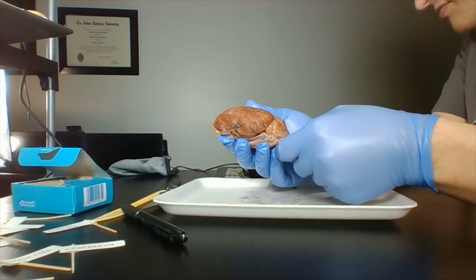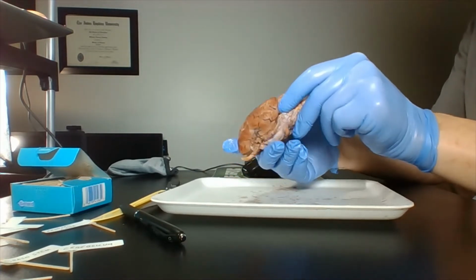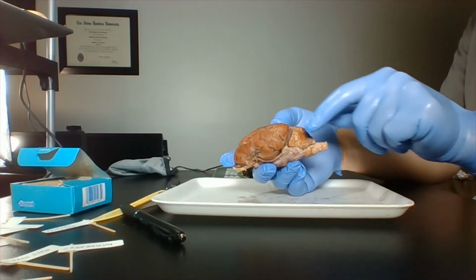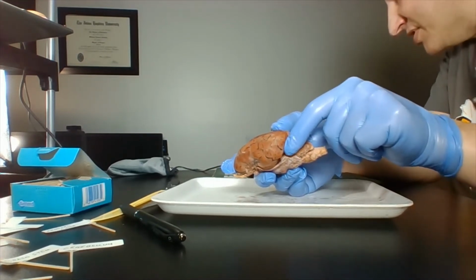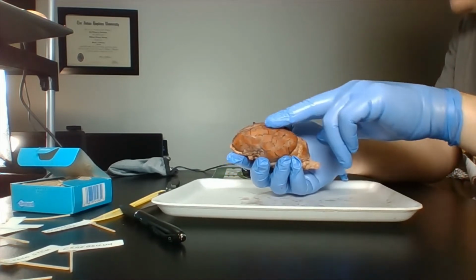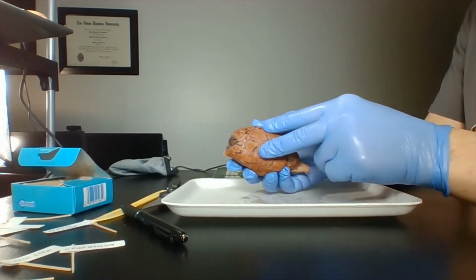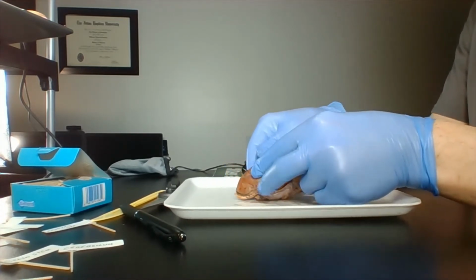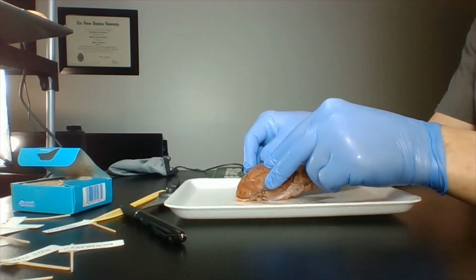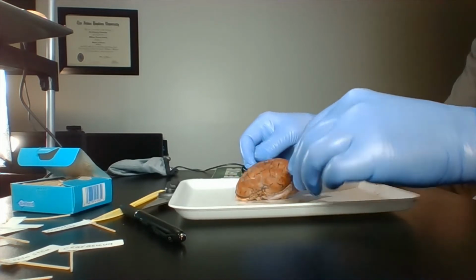The next part is this little part. Like I said, I'm going to keep moving it because I'm trying to show the different angles on both cameras. And this would be the cerebellum. And then this bigger part up here would be the cerebrum. And it has the two hemispheres. So that's going to be the first thing. Then somebody's going to need to take a picture. We're not going to have phones out, so we're going to have to take the picture with your computers with your group.